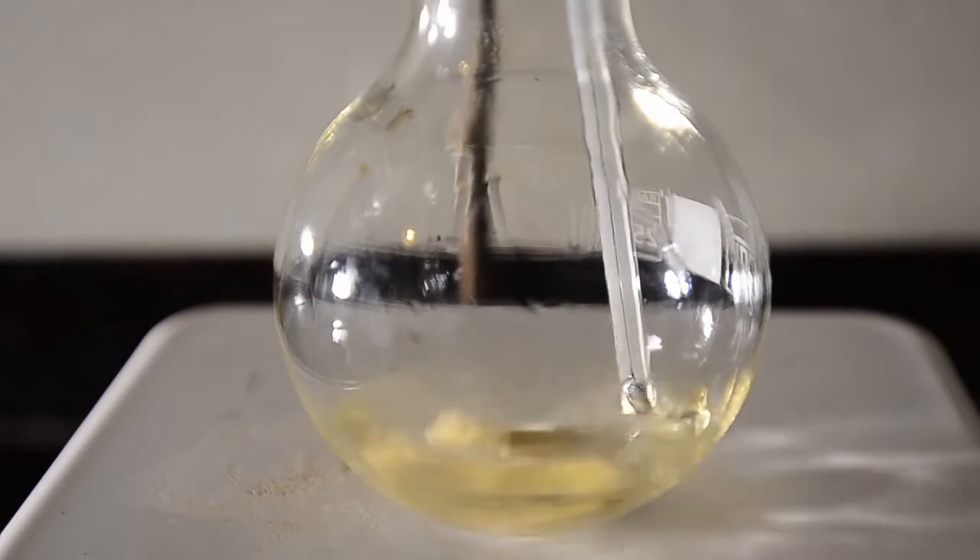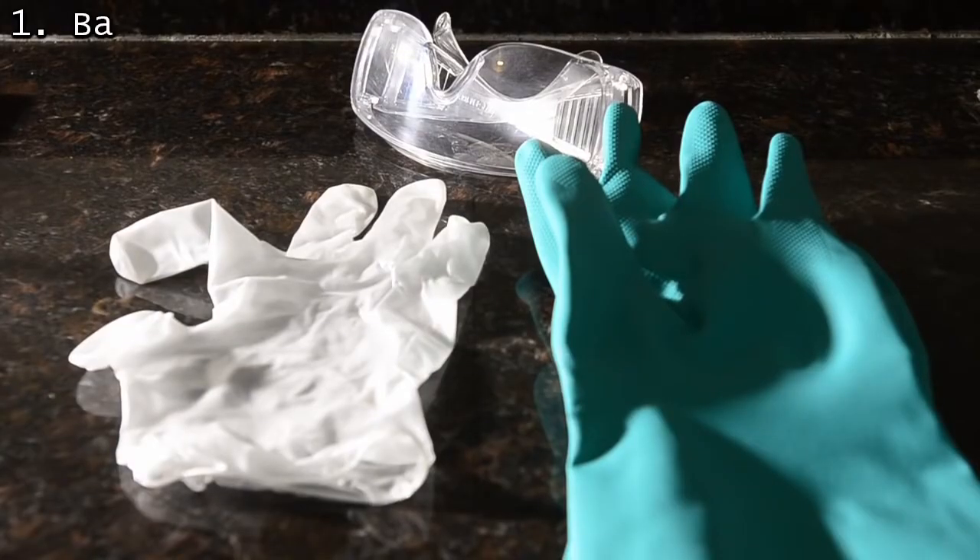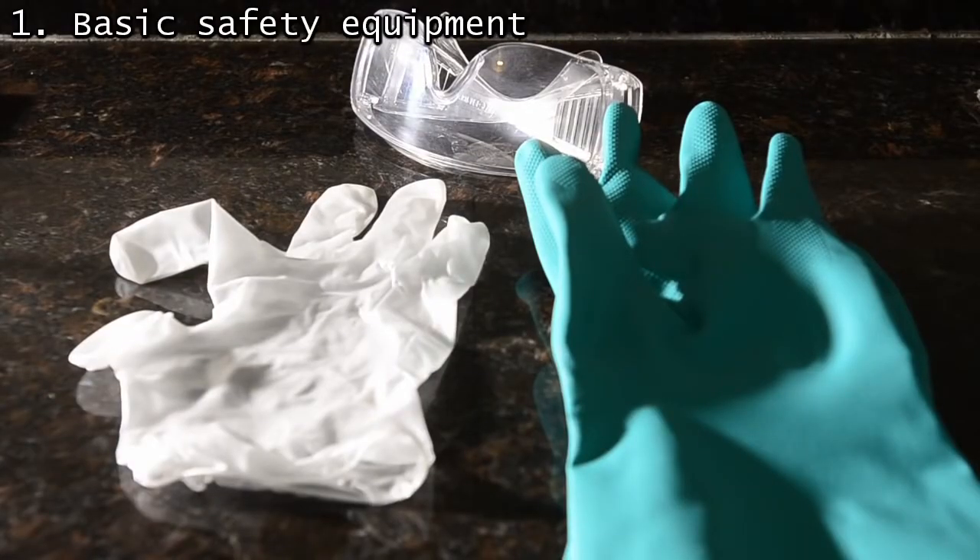Let's start at the start — safety first. It's easy to be safe. You need goggles; ours are polycarbonate ones from a hardware store. Then we have light plastic gloves for normal use and heavy gloves for handling concentrated acids and similar chemicals.